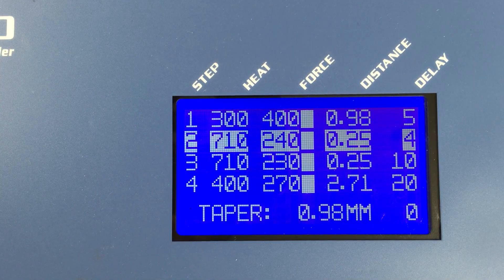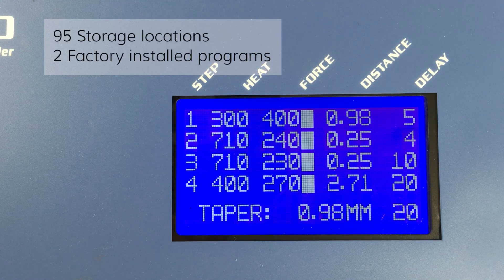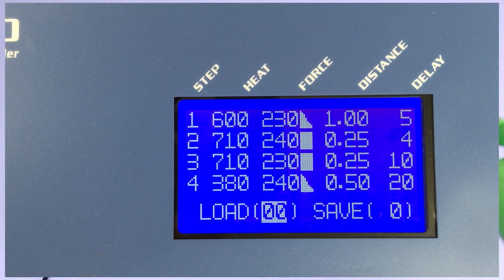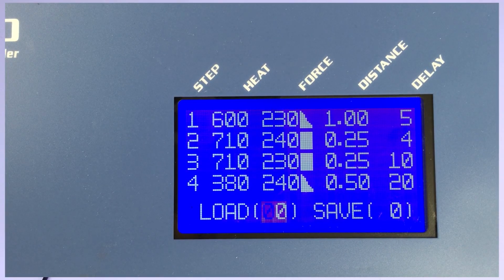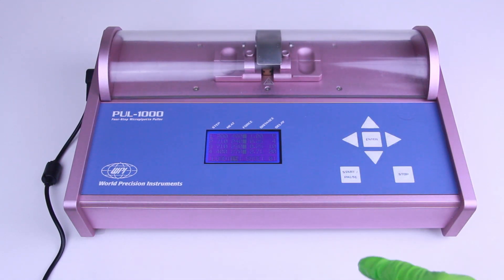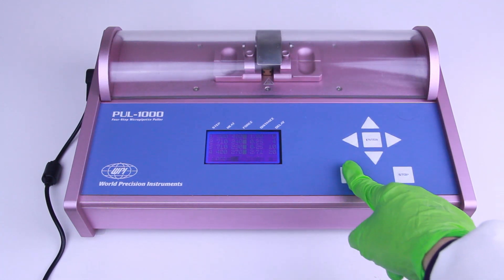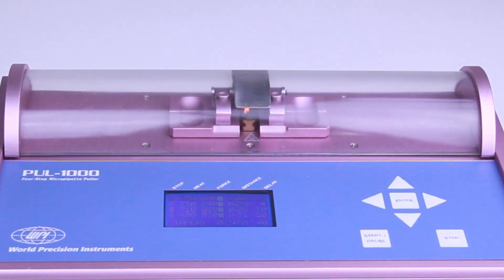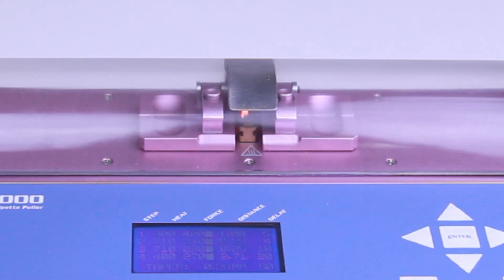The Pull 1000 features permanent memory storage for up to 95 user-selectable programs, including two factory-installed programs. Use the arrow keys to move the cursor to the load field and then press enter. The cursor will begin to flash; when it is flashing, you may use the arrow keys to choose the program you wish to load. Then press start to execute the program. When a program is run, the heating element uses a platinum iridium filament that provides enough heat to melt all common glasses, except for quartz.